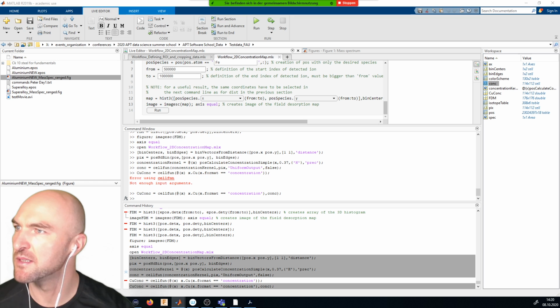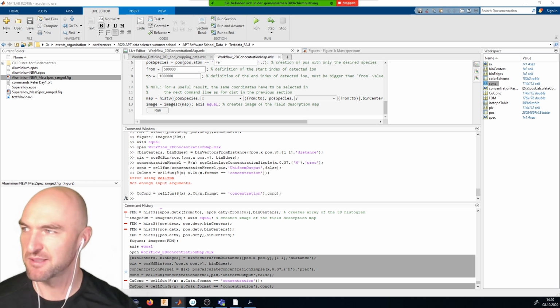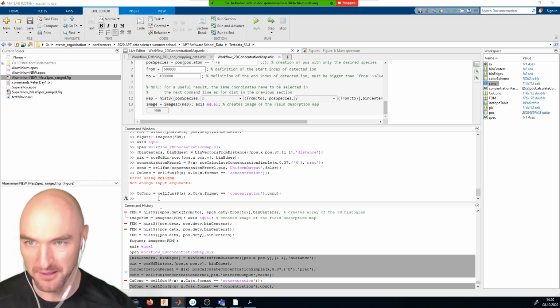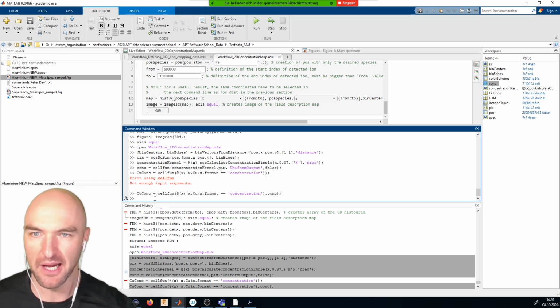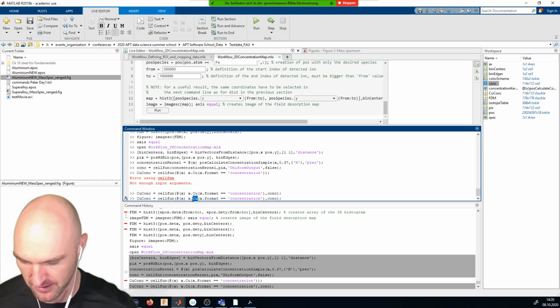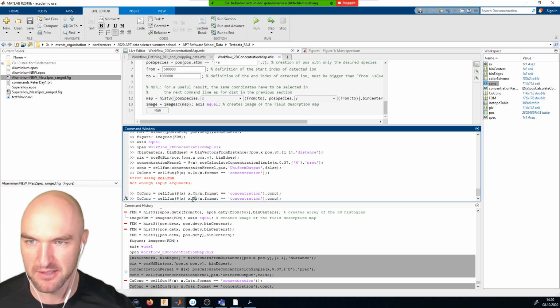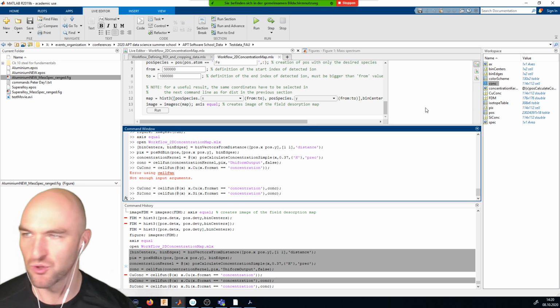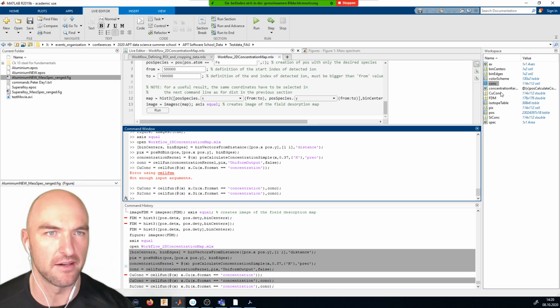That's a question up there. Yes, sorry, Andy. So it took me a second to recall that as well. But essentially now we've pulled out all the copper concentration. I can do the same thing. So it's already there, which means we don't need to calculate anything. I could do the same thing for silicon. Obviously, I should probably then rename the variable to silicon concentration. And with that, we've got a 2D copper or silicon map.